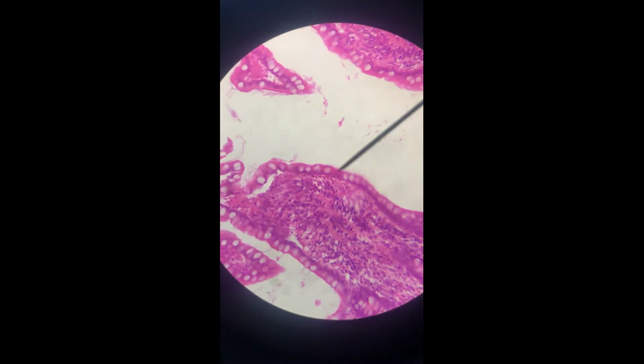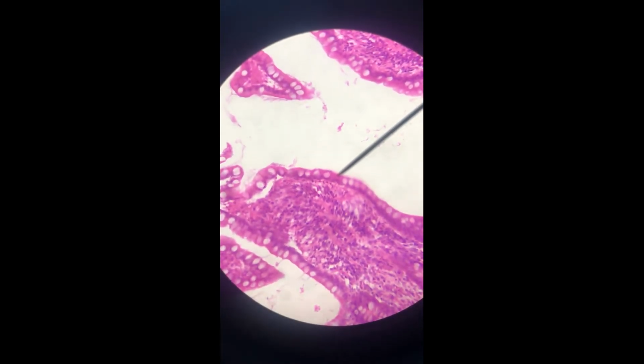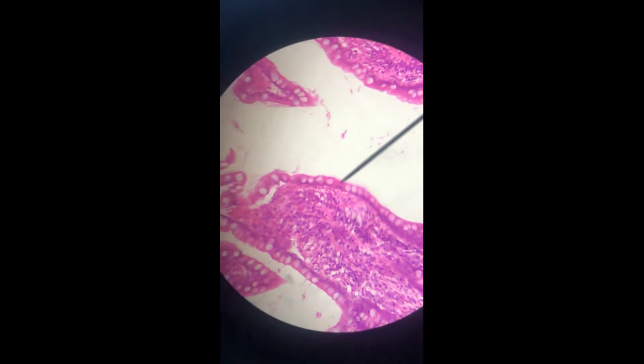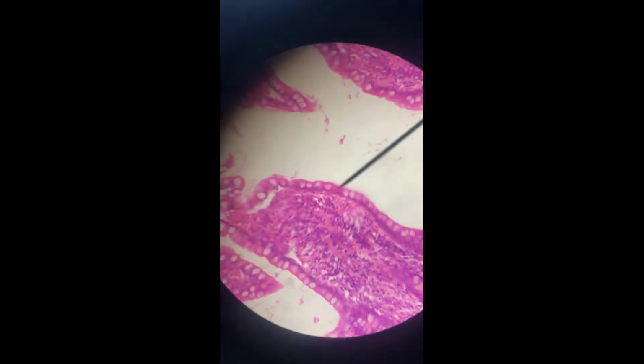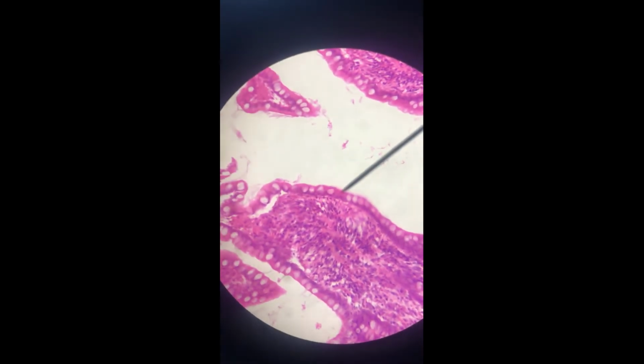There are two tissue types in this larger structure, this fold. We're pointing at the epithelial tissue. It's a simple columnar epithelial tissue, and right below it is connective tissue. And all those dark purple dots are the nuclei. So no, this is not one cell. How many cells do you think are there?